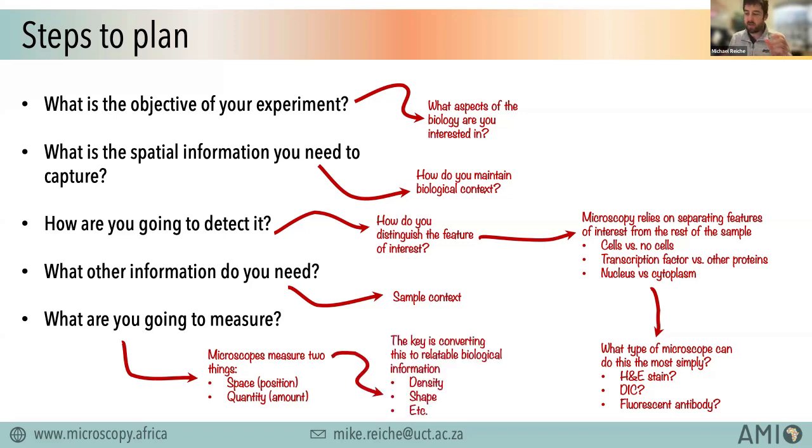The real magic comes in how we combine these two measurements of space and quantity into interesting things such as density or shape or expression. That's where a lot of analysis pipelines come in. But keep in mind what you're trying to measure and how you derive that measurement.